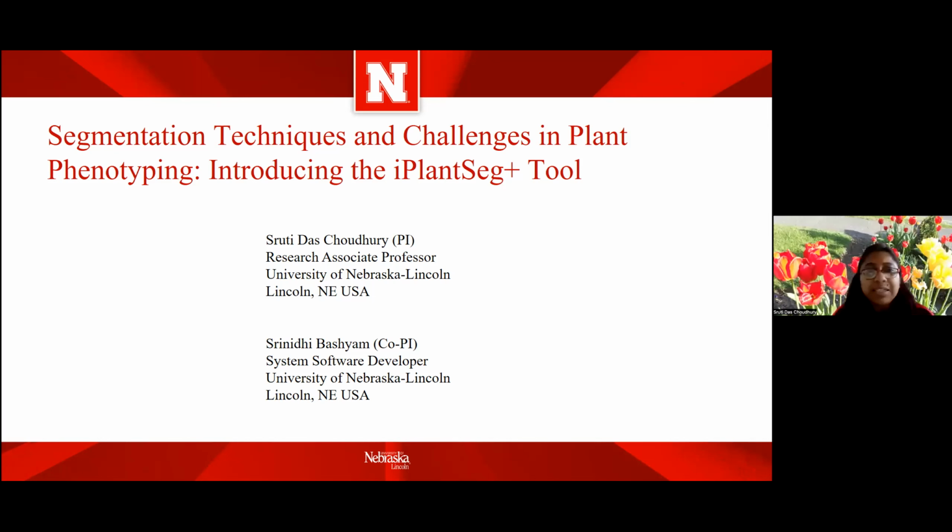Thank you, Nicole, for the wonderful introduction, and good afternoon, everybody. This is Shruti Das Chaudhuri, working as a research assistant professor, recently being promoted to associate professor at the University of Nebraska-Lincoln. Thank you very much for joining us and for participating in this segmentation techniques and challenges in plant phenotyping workshop. We are going to introduce a newly developed tool named iPlantSeg Plus, and Srinidhi Bashyam, co-PI of this seed grant, is here to demonstrate the tool with me.